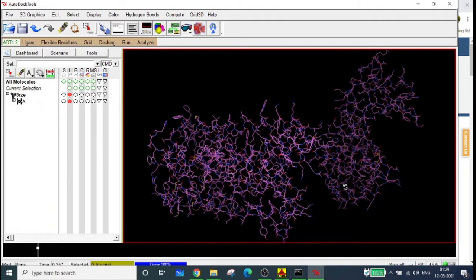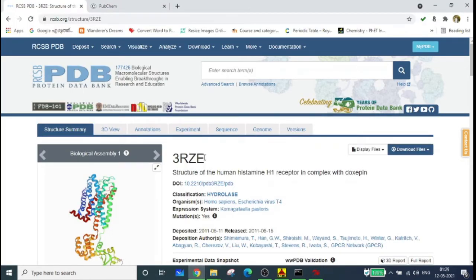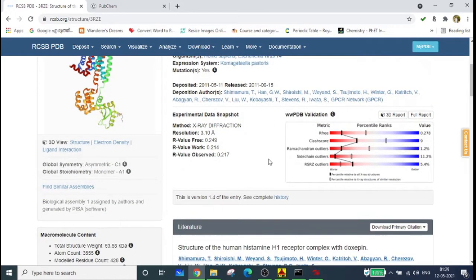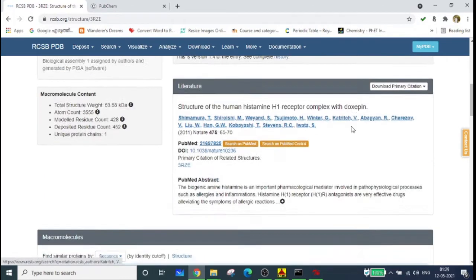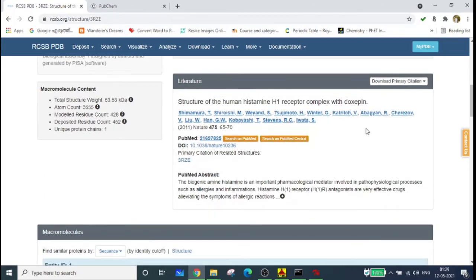To know more about your protein, refer directly to the structure page on the Protein Data Bank. You'll get details such as the determination method — X-ray diffraction — and the resolution, which is 3.10 Angstroms. For more details refer to the citation, as almost everything is mentioned there. Importantly, if you are not doing blind docking, you should identify the position of the docking site. Read the literature and research articles to get that information. If you don't know the docking site, proceed with blind docking, which I'll demonstrate in a later video.